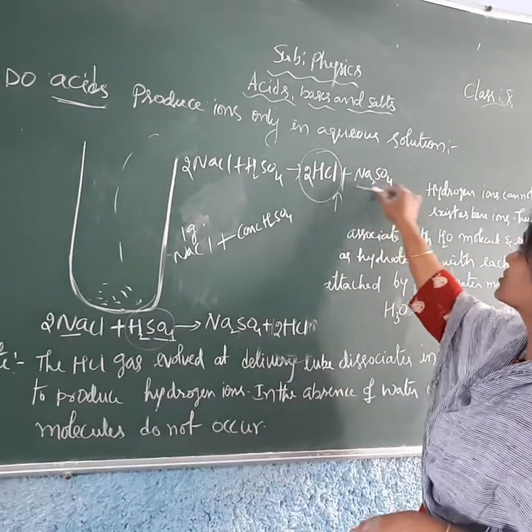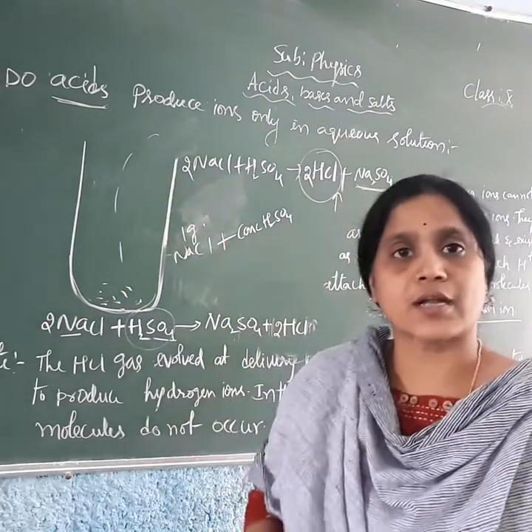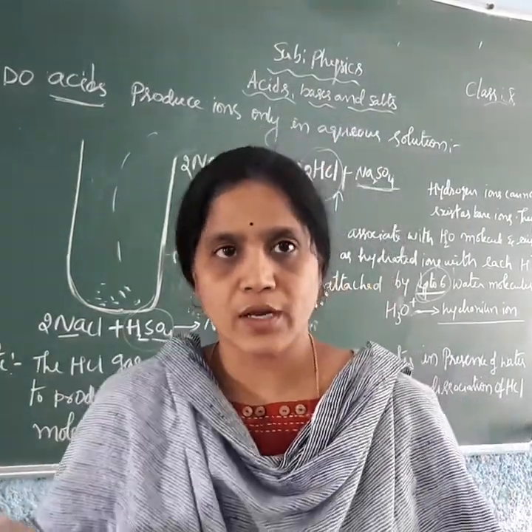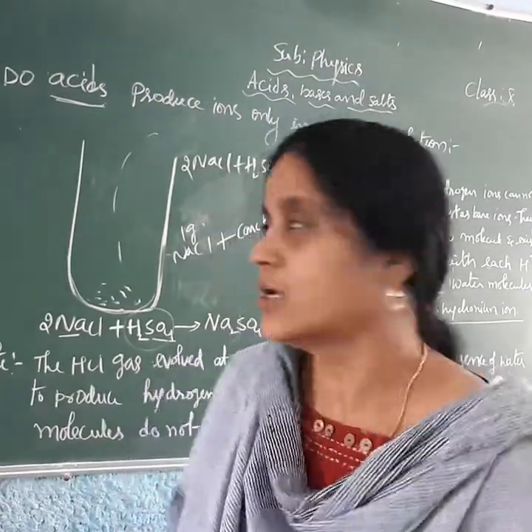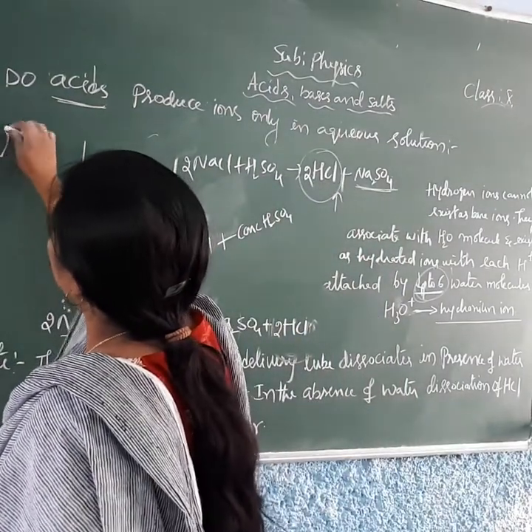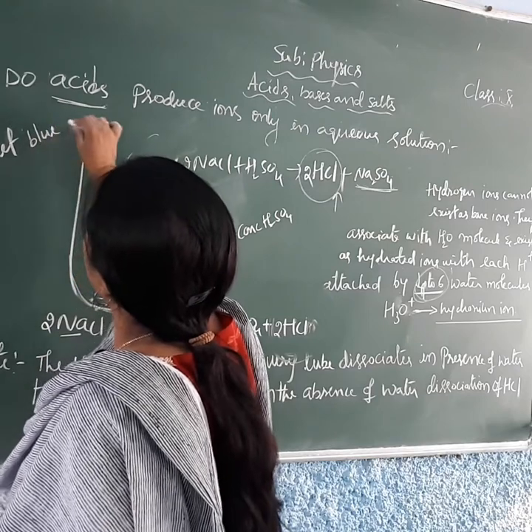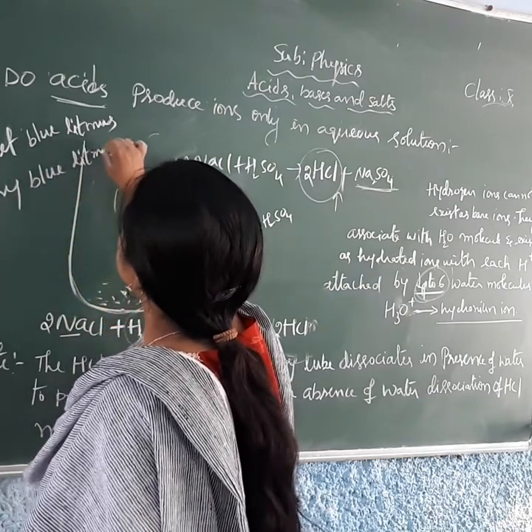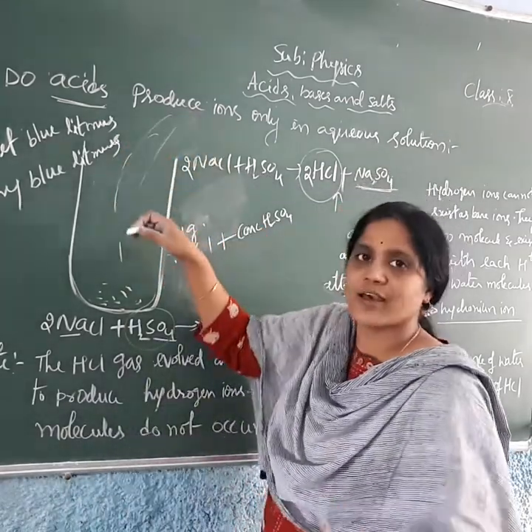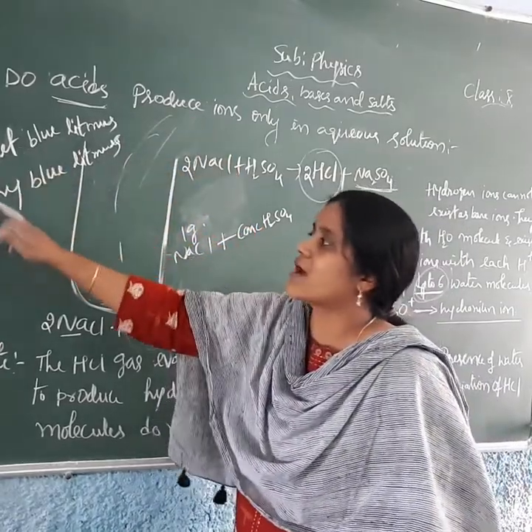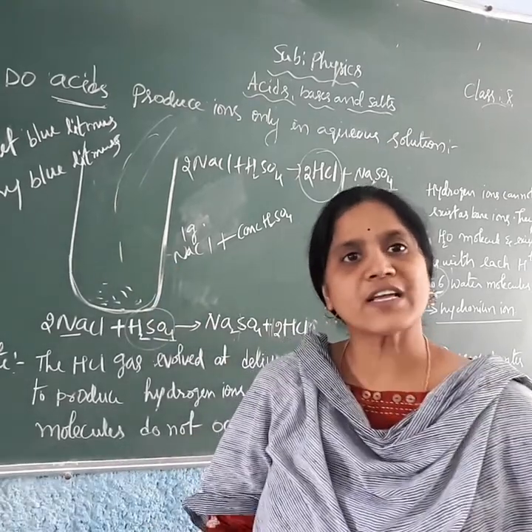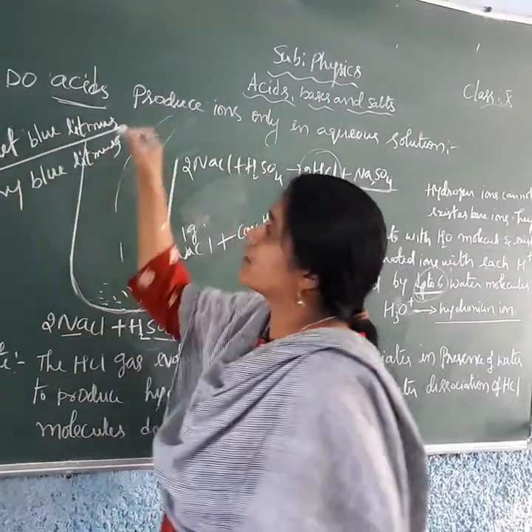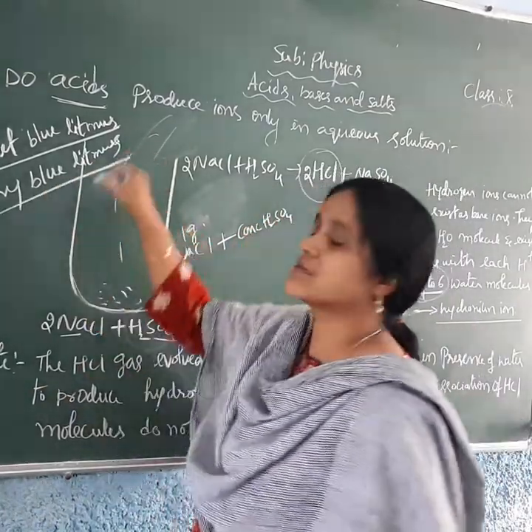Along with that, we get an aqueous solution of sodium sulfate. When the HCl gas is evolving, take two litmus papers. Acids can be tested with blue litmus paper — in the presence of acid, blue litmus changes to red. Take one wet blue litmus paper and one dry blue litmus paper, and place both where the gases are evolving. Observe which litmus paper changes color.